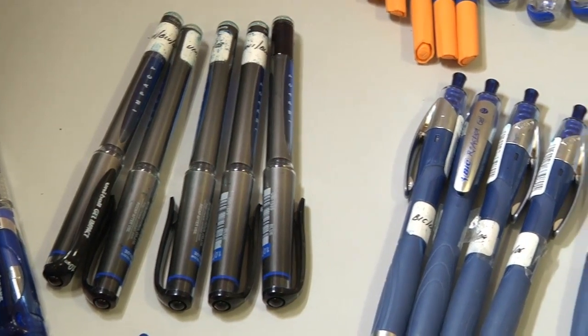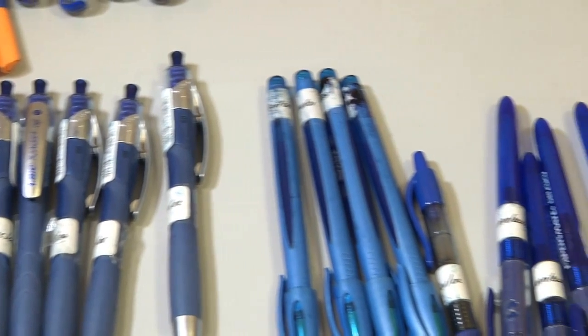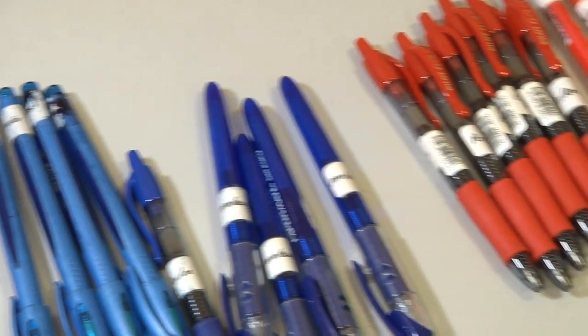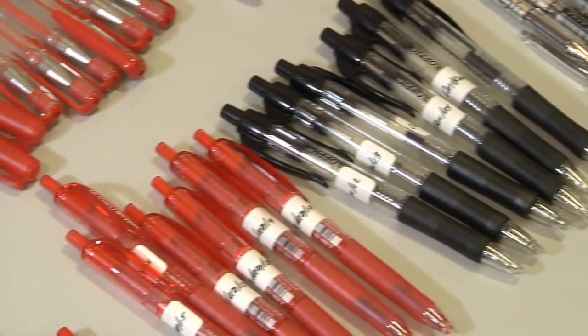As part of my work here at the university, I have analyzed ink from over 400 different gel pens of different brands and models and using different Raman spectrometers. I am testing the different instruments to see which one gives the best results.